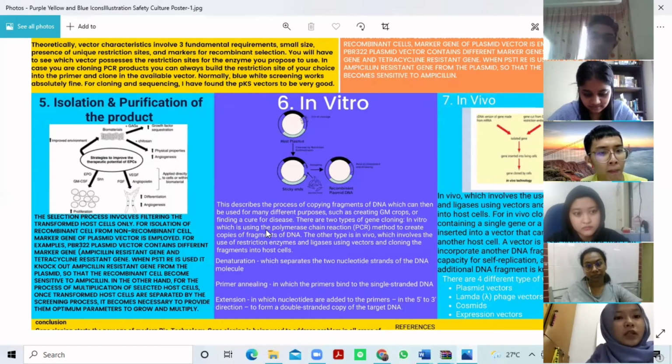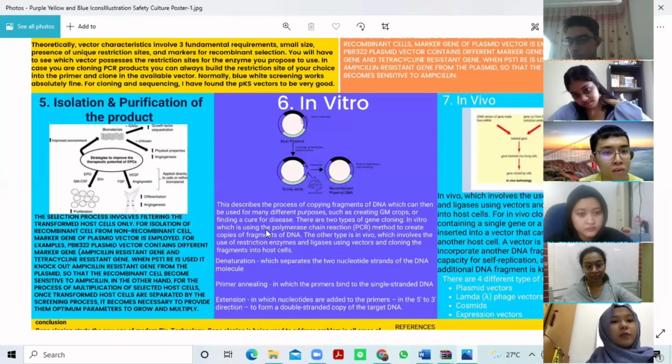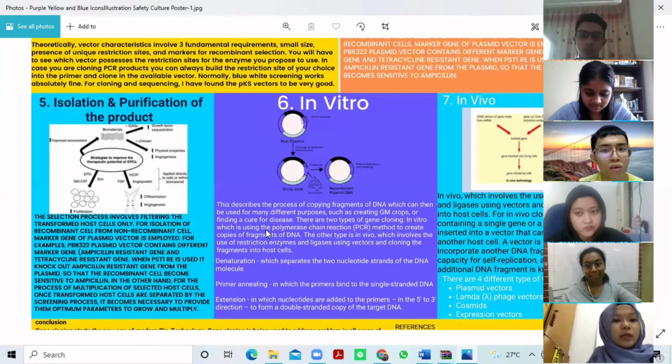Modern bacterial cloning vectors use the blue-white screening system to distinguish colonies of transgenic cells from those that contain the parent vector. In this vector, foreign DNA is inserted into a sequence that encodes an essential part of beta-galactosidase, an enzyme whose activity results in formation of a blue-colored colony on the culture medium that is used for this work. Insertion of the foreign DNA into the beta-galactosidase coding sequence disables the function of the enzyme, so colonies containing transformed DNA remain colorless.